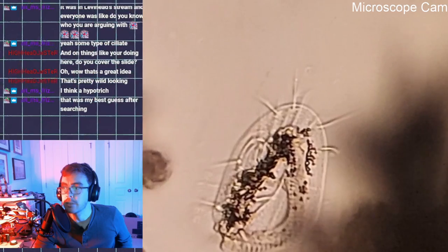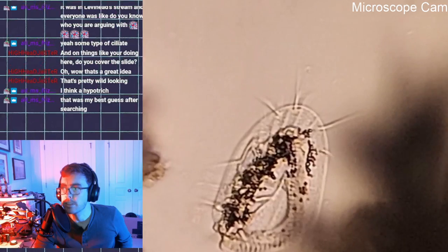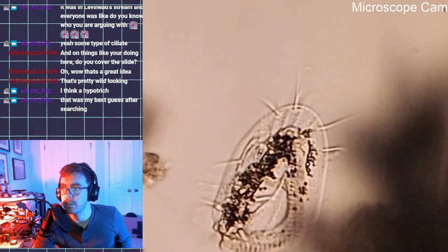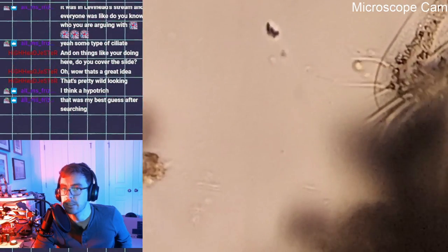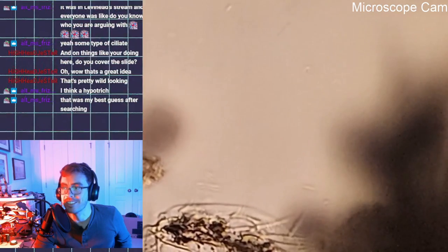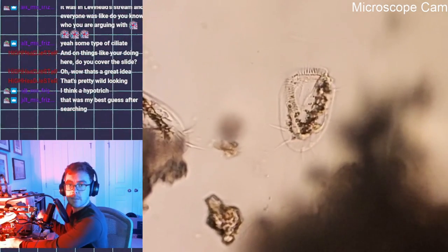Yep. They do exactly what you think they do. They run those little bristles and look like they filter through the water that they're in. The term hypotrich comprised all ciliates possessing a relatively flattened body shape, strong cirri, which are the groups of, I believe, large hairs that we're seeing. Yeah, so those are the cirri. Oh, he's going over there. In a large oval region, partially surrounded by an adoral zone of membranelles. Okay, interesting. Yeah, no, I think you're right. Who knows what particular species, but hypotrich. Oh, there's two. Hypotrich.